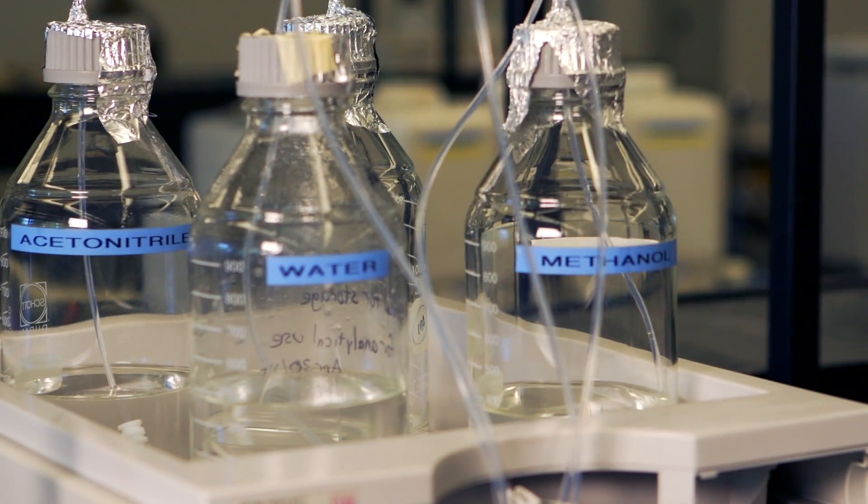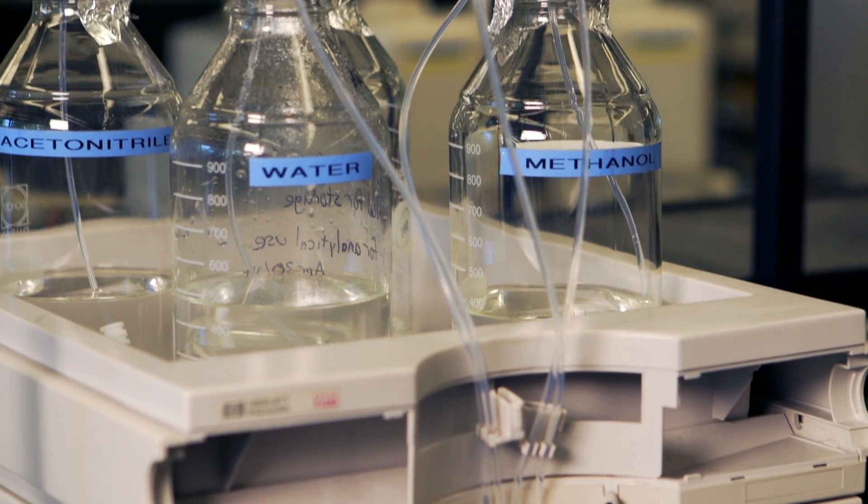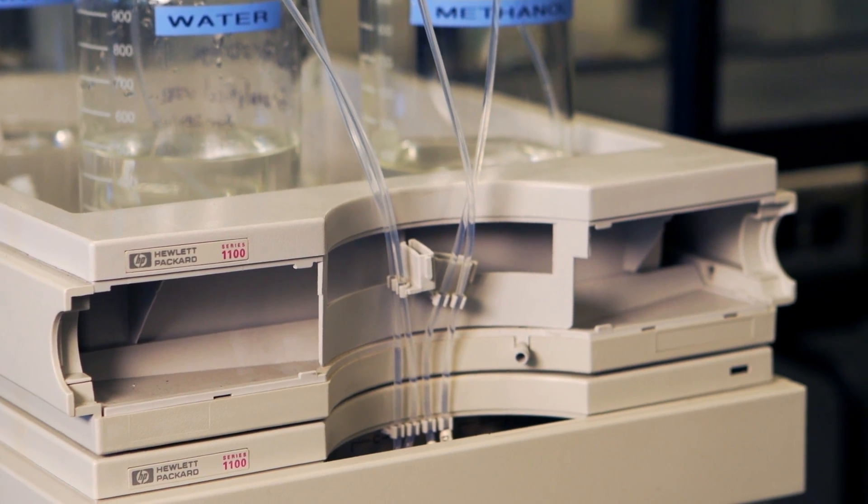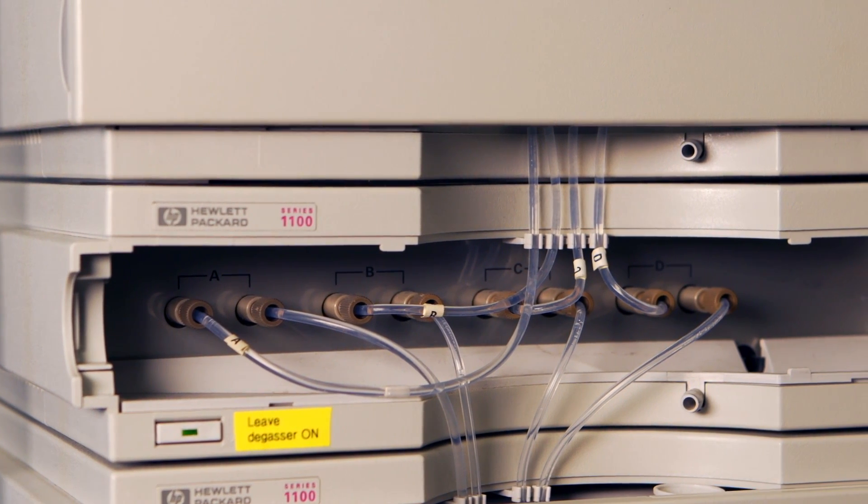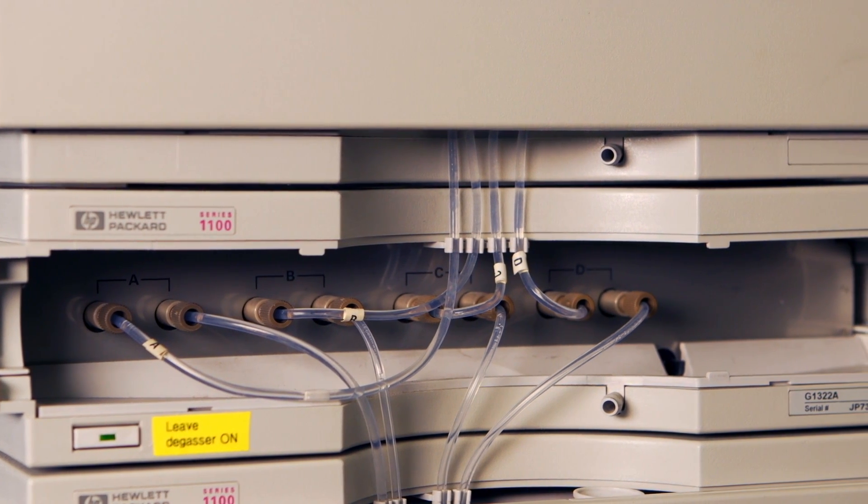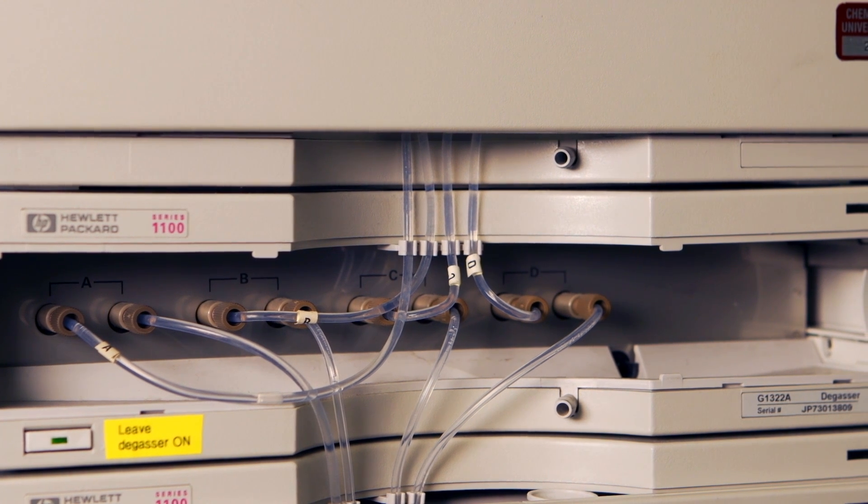We'll start with the solvent reservoirs. The solvent reservoirs hold the solvents that will be used as the mobile phase. Up to four solvents can be mixed to make up the mobile phase. Before the solvent is pumped into the column, it's first moved through the solvent degasser. Dissolved air is removed from the solvent to give more reproducible pumping and to avoid bubble-related peaks in the chromatogram.